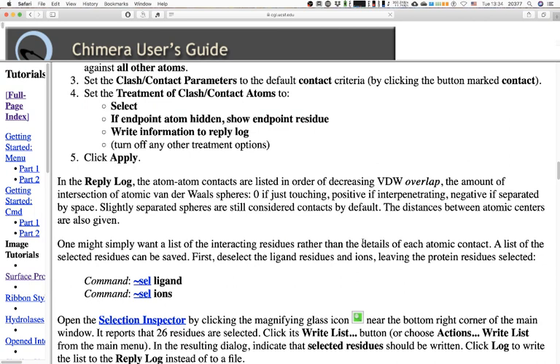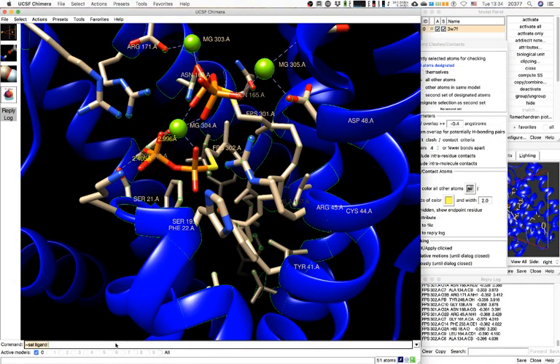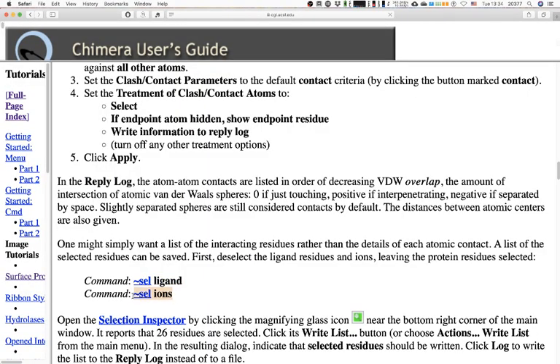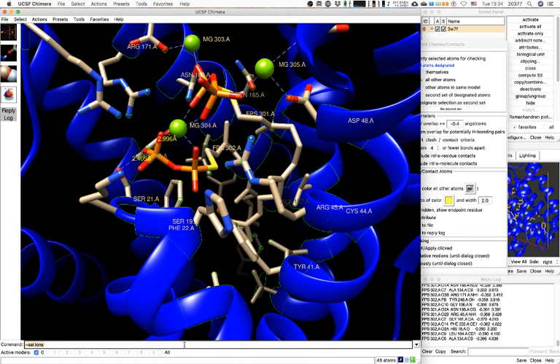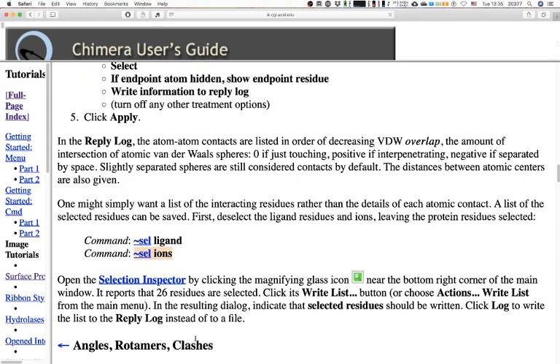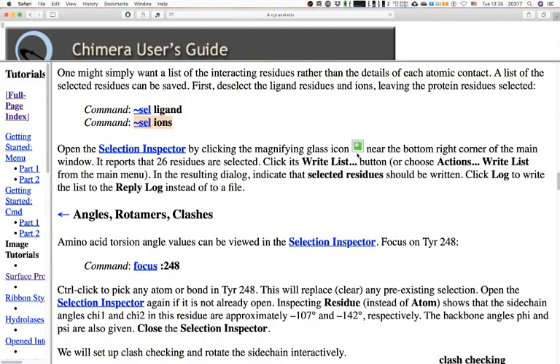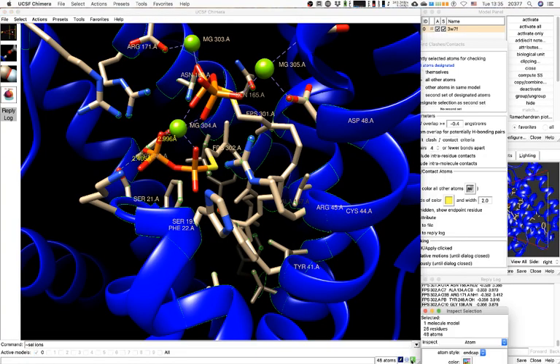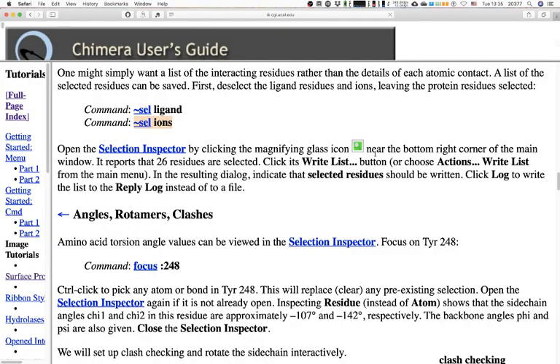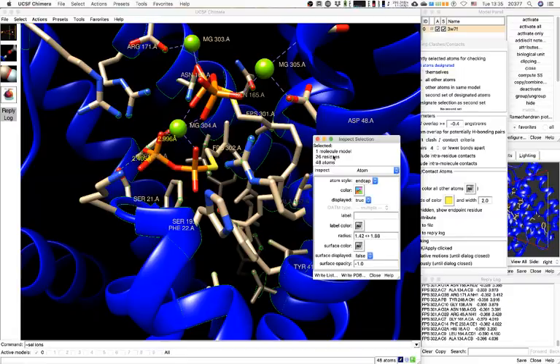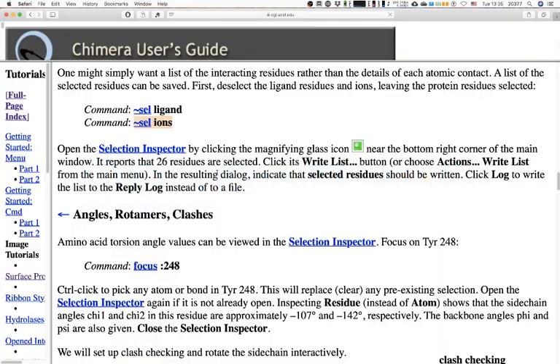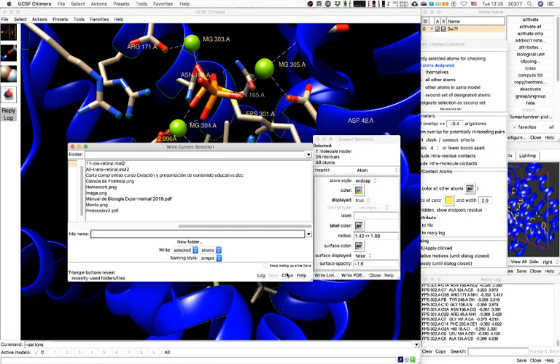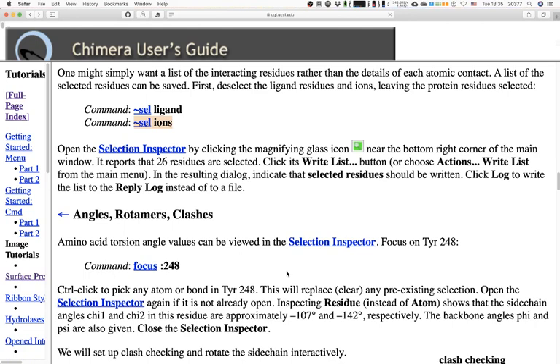To list the interacting residues rather than every atomic contact, first deselect the ligand, then deselect the ions — now only the protein residues remain selected. Open the Selection Inspector — it shows 32 residues selected. We can click 'Write List' at the bottom to save just the selection, or save it to the log file.